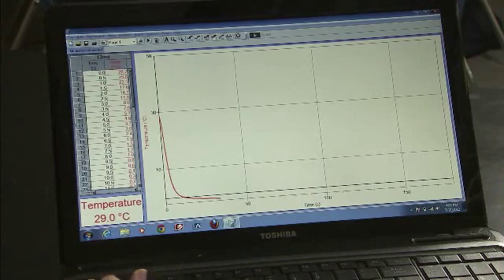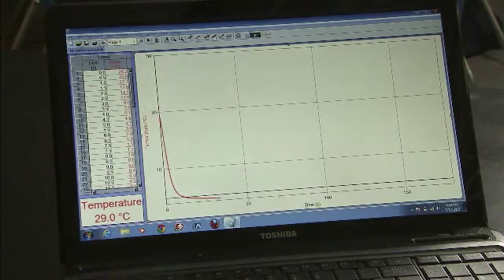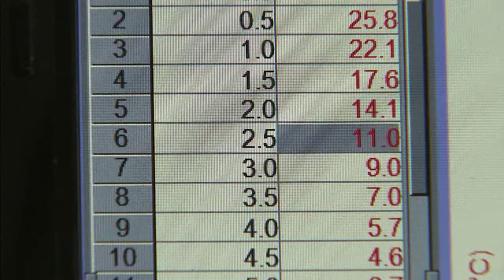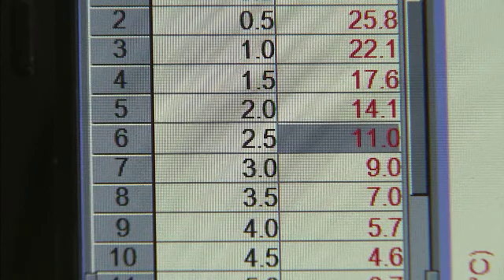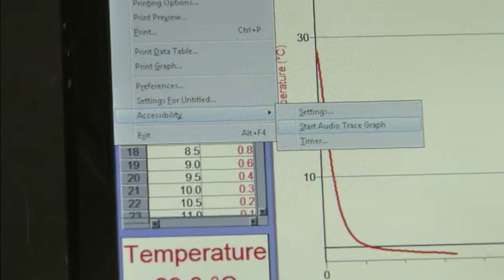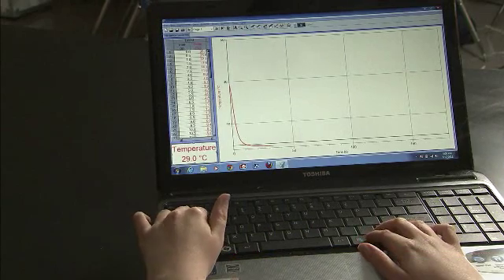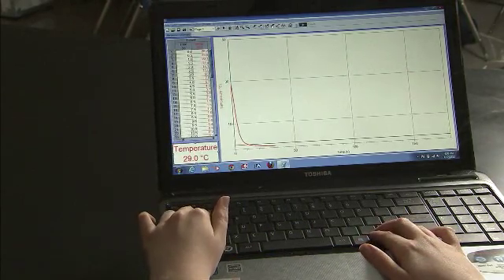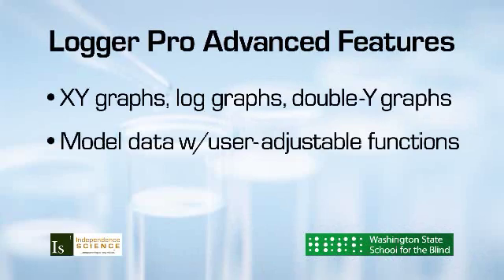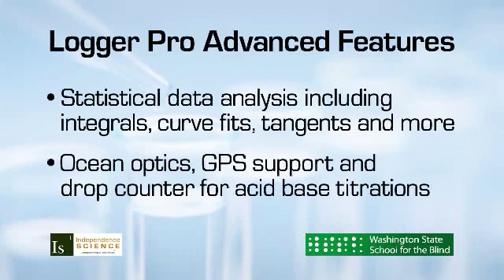By using Control Tab, Aaliyah can navigate between the data table and graph panels on Logger Pro. Using the arrow keys, Aaliyah can review the data in the data panel. One of the accessibility features in Logger Pro is the ability to gain a qualitative understanding of the graph using the audio trace graph function, which can be found under the file menu in the accessibility options. The length of the audio trace can be customized based on the experimental parameters. Logger Pro also has many advanced statistical analysis features that are appropriate for more complex experiments.